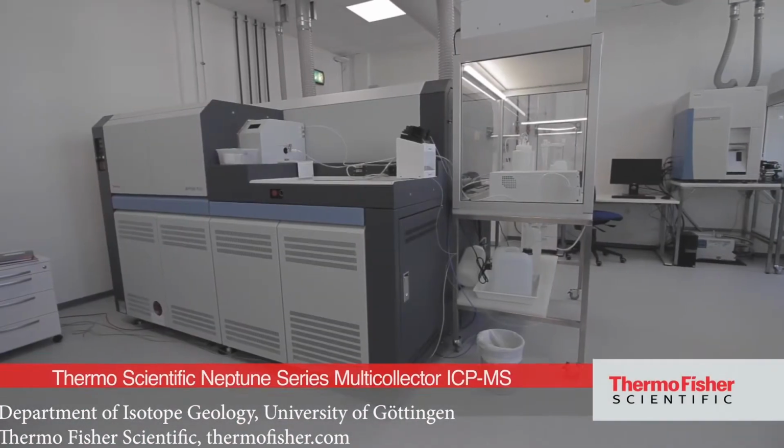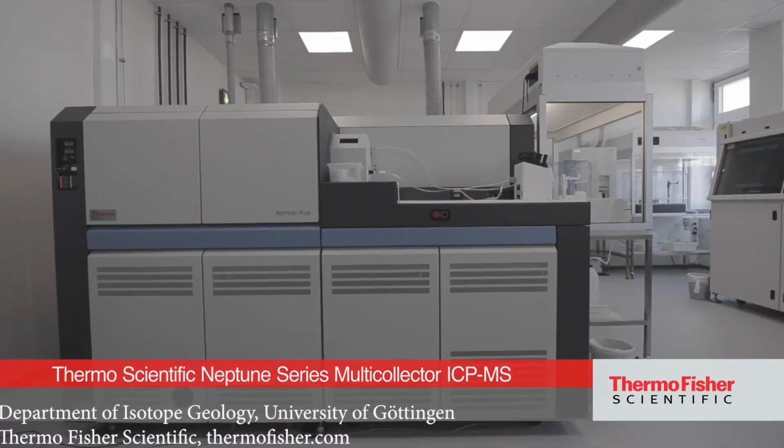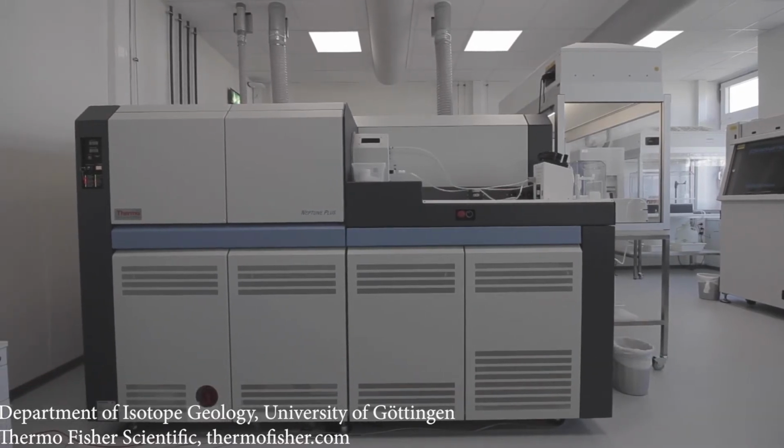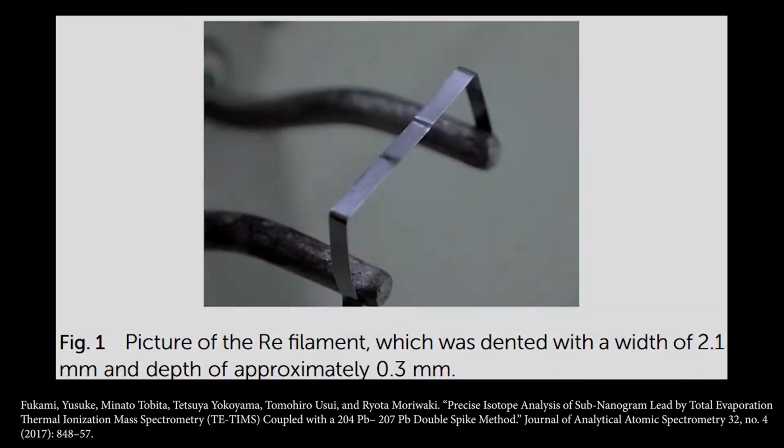So this is an example of a lab in Göttingen, and they are doing isotope ratio measurements. You can use an ICP to do this. You can see this particular instrument. There's the torch. This is an ICP, but there are other methods you can use as well.